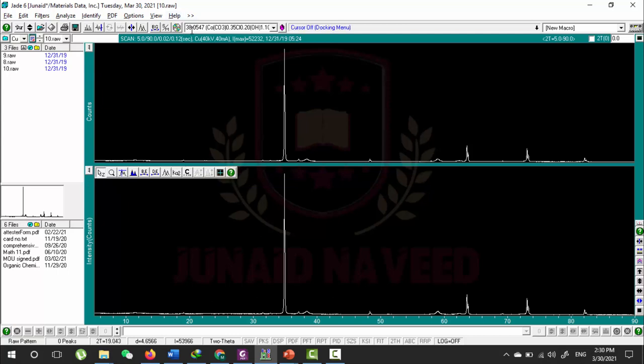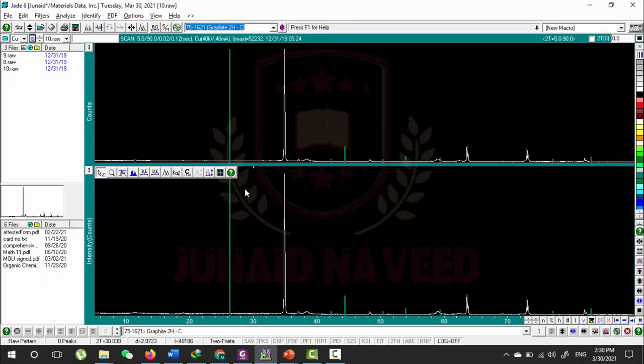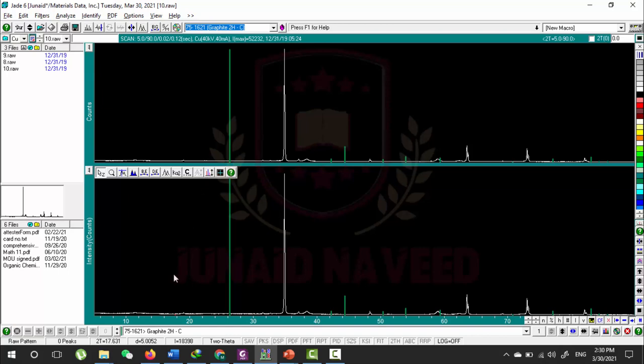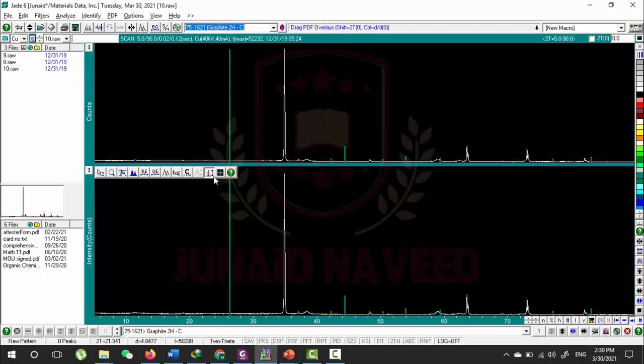Let me first overlay a PDF. For example, this PDF is overlaid. There is no other pattern overlaid to my pattern, so I cannot use this scan overlay button. However, I can use this button and change the intensity of this overlaid PDF.